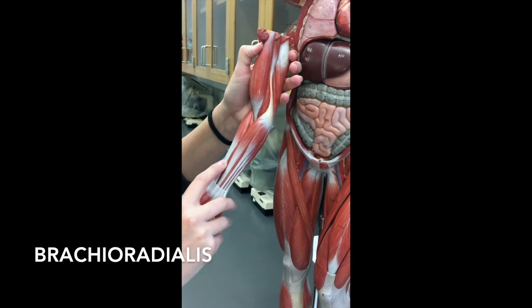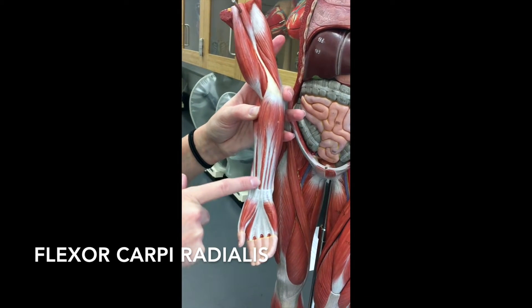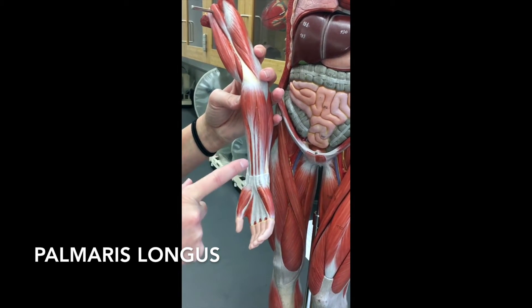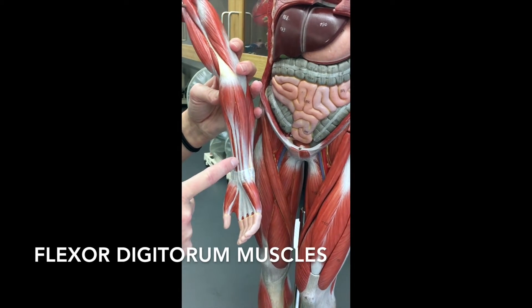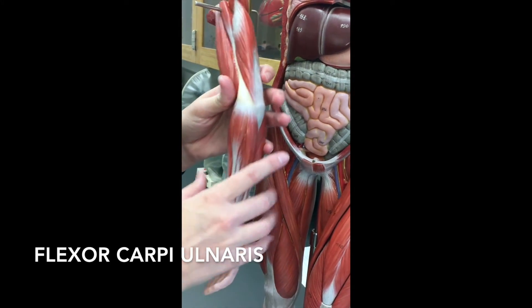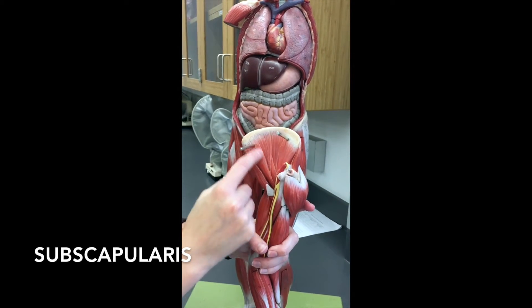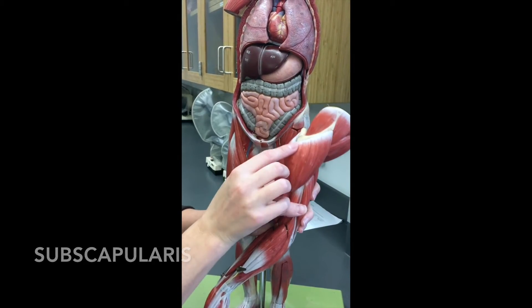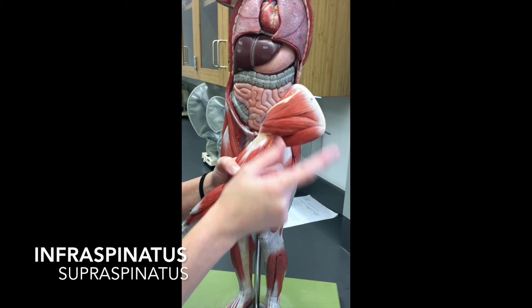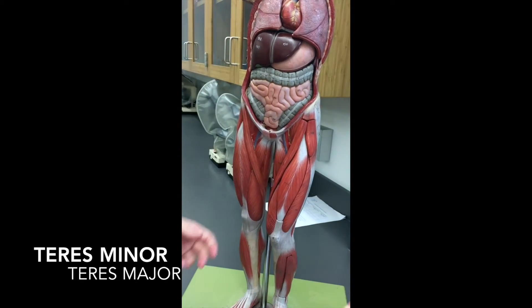We still have the brachioradialis here. On the inside we have a flexor carpi radialis going to the thumb. We have palmaris longus — the superficial one that goes to the palm. Deep to that is your flexor digitorum, that little piece of muscle you can barely see between them. And over here is flexor carpi ulnaris. Taking this off, we have the subscapularis muscle here — remember, this is the scapula. Taking the deltoid off: supraspinatus because it's above the spine, infraspinatus here, teres minor here, teres major here, and subscapularis underneath.